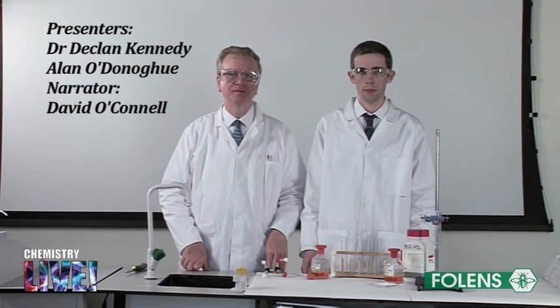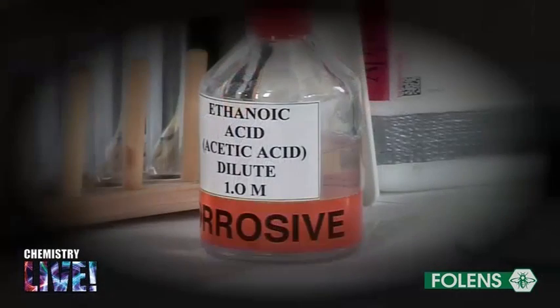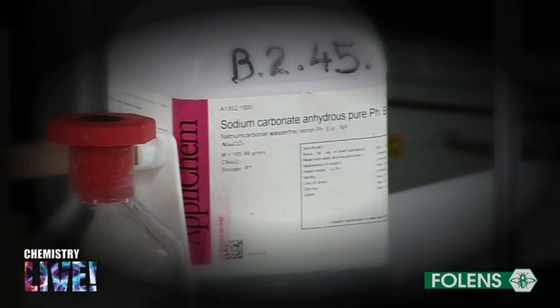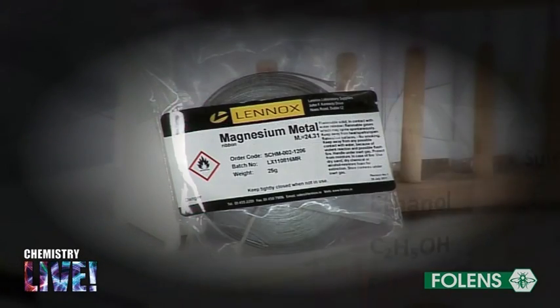In this experiment we will investigate the reactions of ethanoic acid with sodium carbonate, magnesium metal, and ethanol.